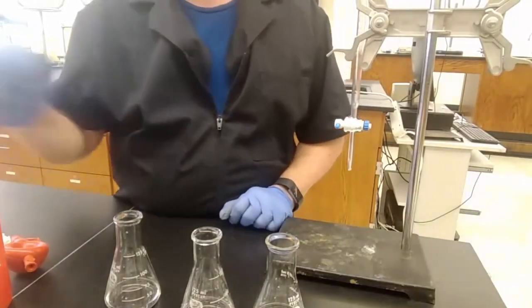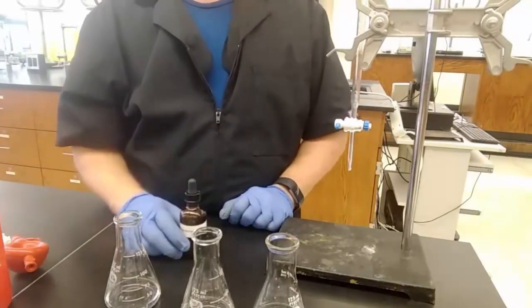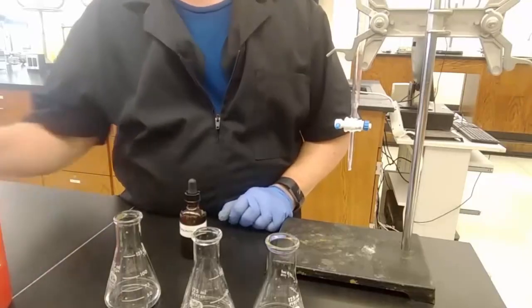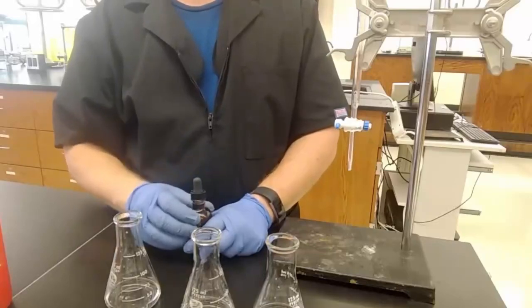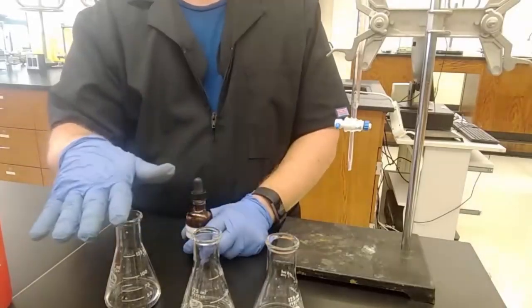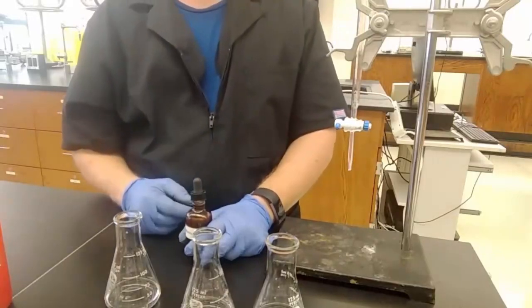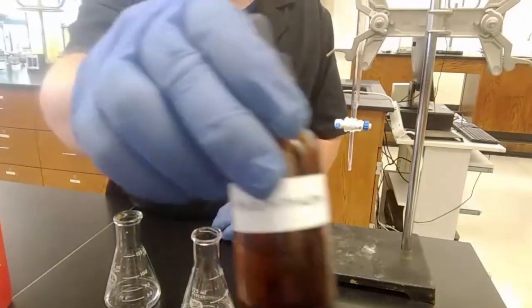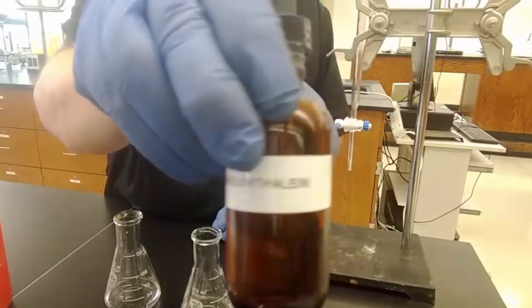All right, we're going to add an indicator, because we absolutely need an indicator. Just like in the pH lab, other than the pH meter, everything changed color for us to be able to determine the pH. So same thing here. We've got to have some way of telling when all of the acid in our vinegar flasks has reacted with the base that we're going to put into our burette. So the indicator that we use is called phenolphthalein, which is a solid that was dissolved in some water here.